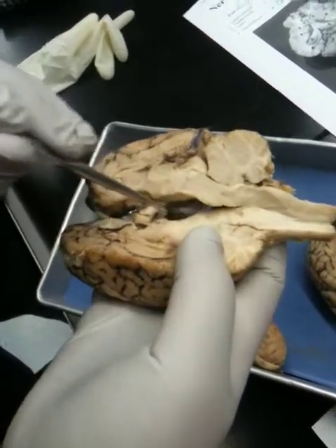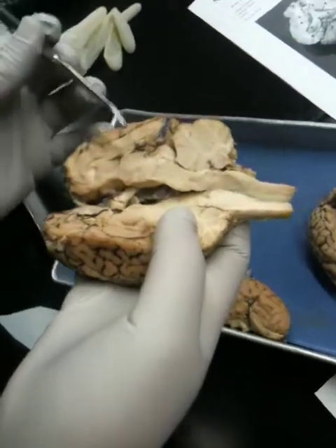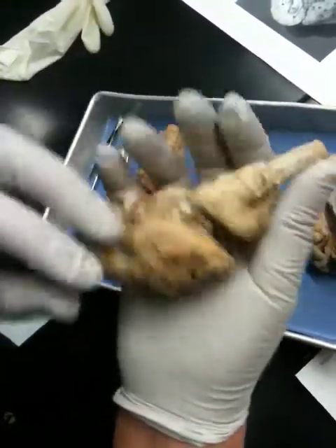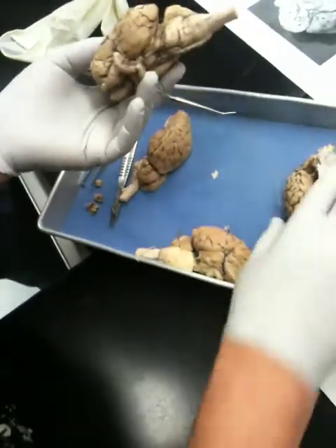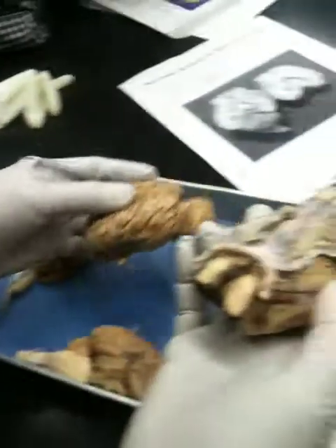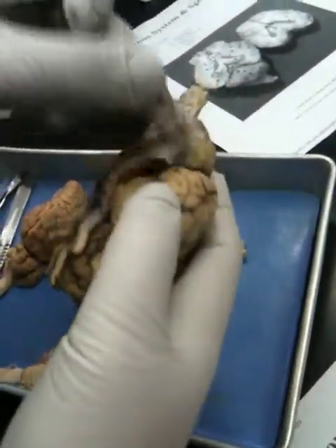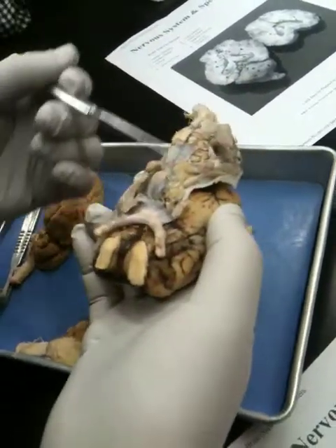This is the pituitary gland that sits here, and this is the optic chiasma. It doesn't have a pituitary either — none of your brains do. That's why I brought mine from El Camino. You can see why it still has it because it still has the dura mater. That comes off and it's gone, so if you yank this off, you lose all of this.